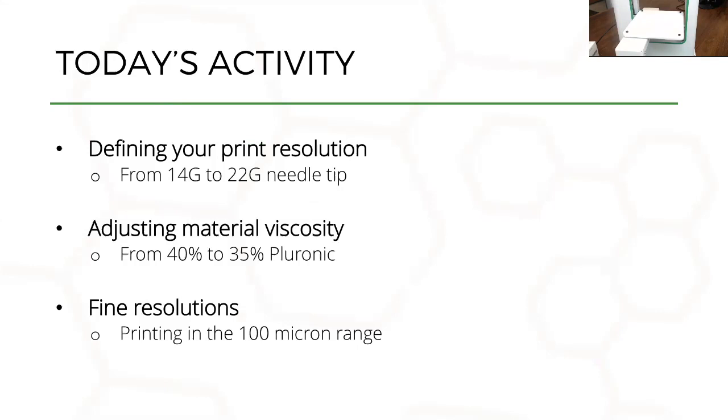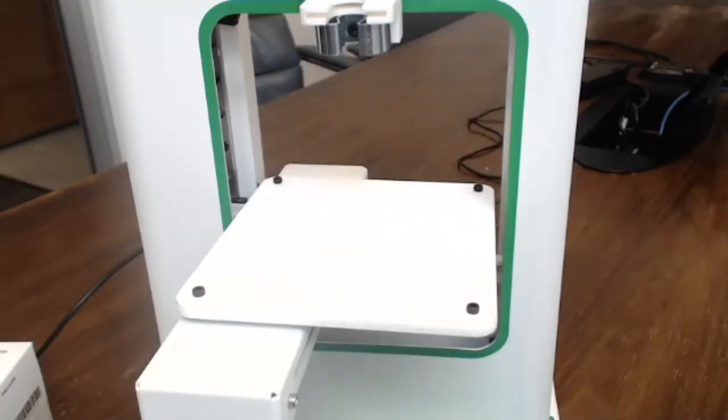So with that, I'm going to switch over to the Slicer program software. This is where you can actually follow us and open the Slicer program, and you can step by step follow Oliver through this. So I'm going to hand this over to Oliver.